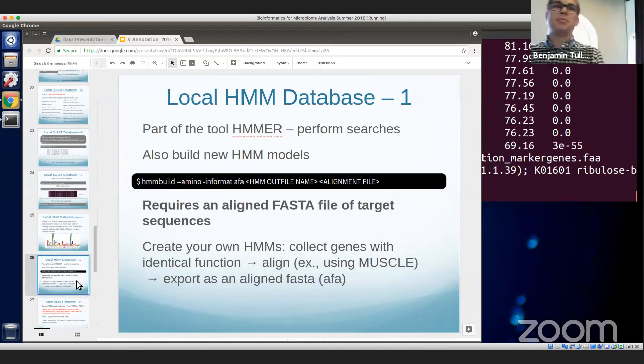You can do these homology searches where you take a new candidate and BLAST it against stuff and look for things, or we could build an HMM model for that. That HMM model doesn't exist. It's not in the database, but we could get a couple of these proteins that we think have similar homology, make some judgment calls, and then build a model, and then use that model to search against a larger database in a more high throughput, higher confidence way of figuring that out.